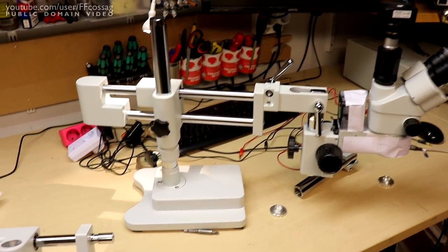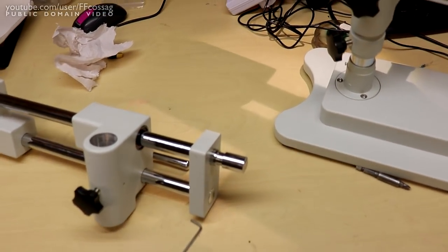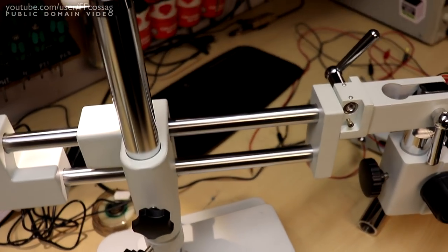Okay, we now have the new arm mounted. There you can see the shiny old one. So how does this one ride?